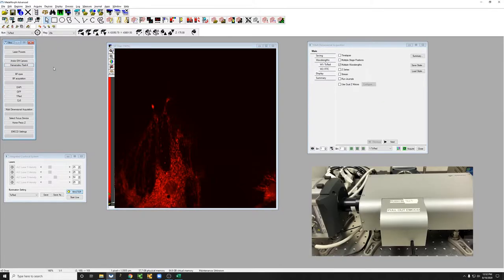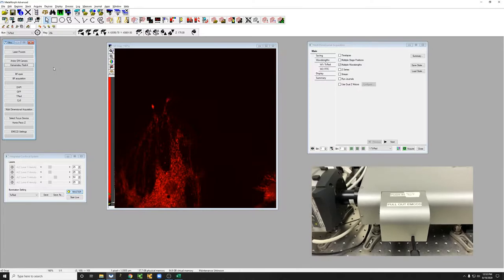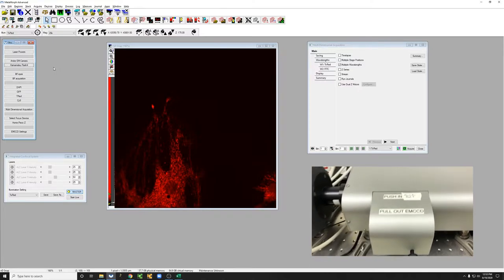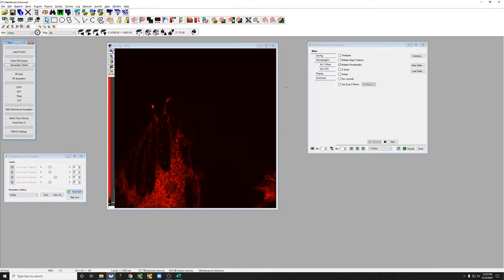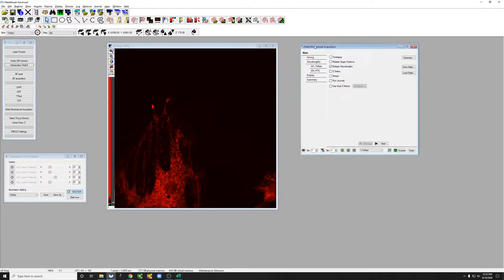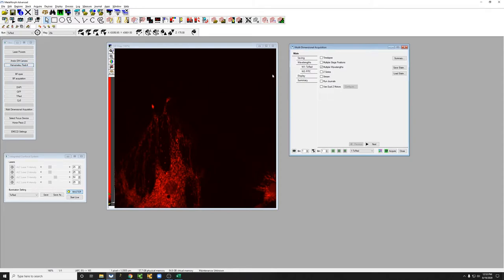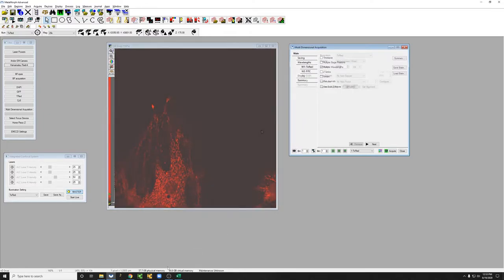Let me push in the slider physically on the microscope. When you switch between these, that resets the whole multi-dimensional acquisition. So I will set that back to how it was and then restart the video.